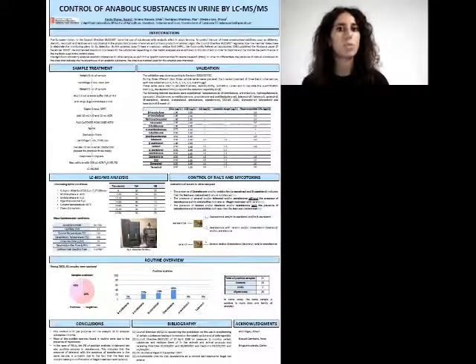Council Directive 96/22 bans the use of substance with anabolic effect in stock farming, and Council Directive 96/23 regulates how the member states have to monitor plans for the detection of unauthorized additives such as thyreostats, steroids, resorcylic acid lactones, and mycotoxins. To validate the method, recommended maximum CC alpha are established in the guidance paper 2007. A method for the analysis of steroids, resorcylic acid lactones, and mycotoxins with LC-MS detection was developed and validated according to Decision 657.